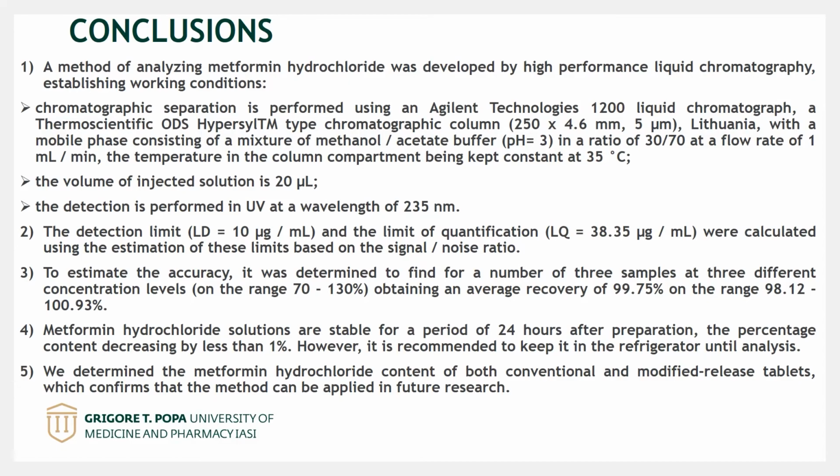2. The detection limit, LD equals 10 micrograms per milliliter, and the limit of quantification, LQ equals 38.35 micrograms per milliliter, were calculated using the estimation of these limits based on the signal-to-noise ratio. 3. To estimate the accuracy, the recovery was determined for 3 samples at 3 different concentration levels, on the range 70 to 130%, obtaining an average recovery of 99.75% on the range 98.12 to 100.93%.